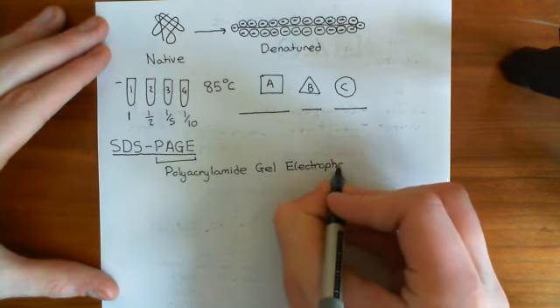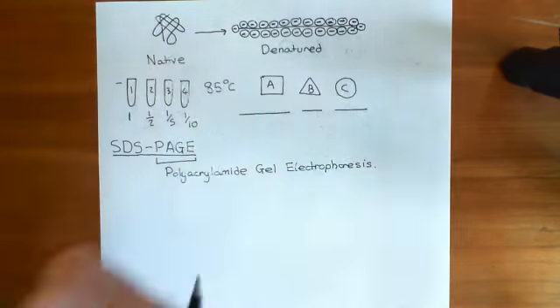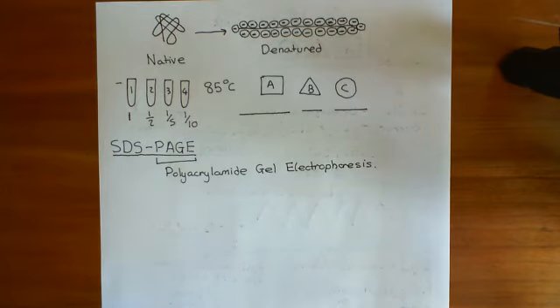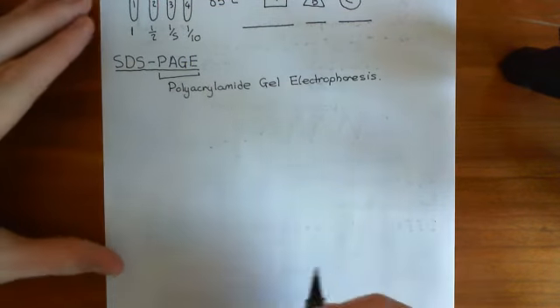Now, basically, this is a technique to separate these polypeptides, these denatured polypeptides, according to their length. Polypeptides which are very, very short will be able to move extremely rapidly through the gel, whereas polypeptides that are very, very long won't be able to move so rapidly, they'll take much longer, so we can separate them out by size. But we'll explain this in more detail now.